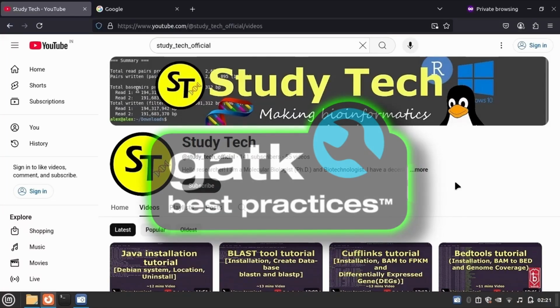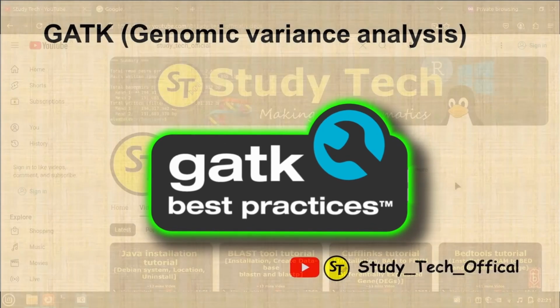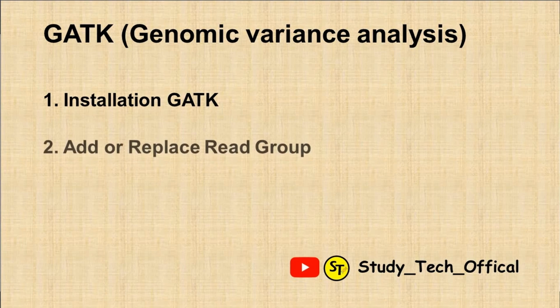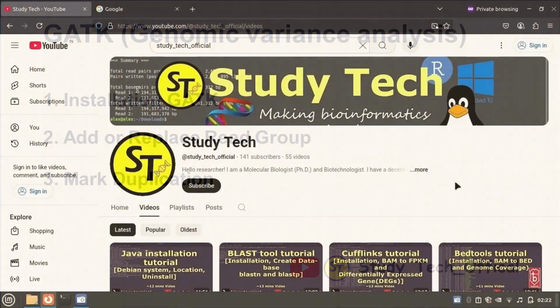Today I am going to demonstrate the GATK tool and its best practices for genomic variant analysis. In the first step, I'll demonstrate how to install the GATK tool, and after that, for the genomic variant analysis, we'll first add or replace the read group of the BAM file, and then use mark duplication for our BAM file.